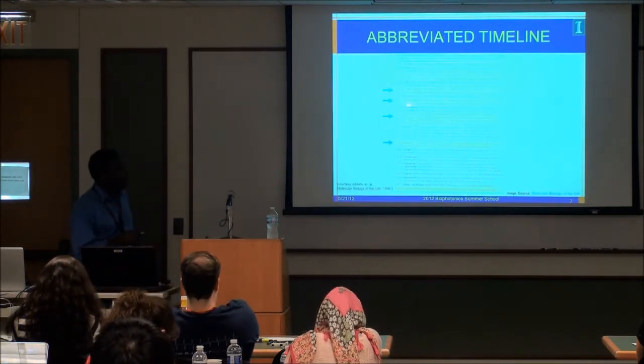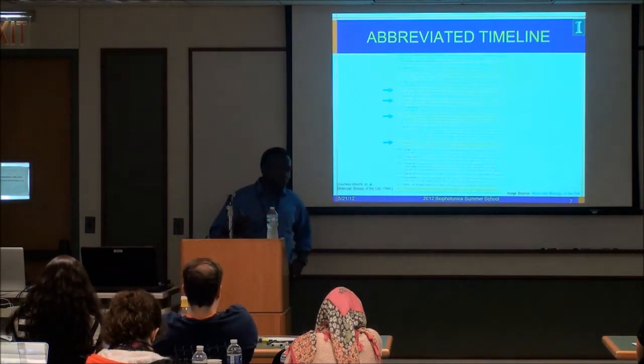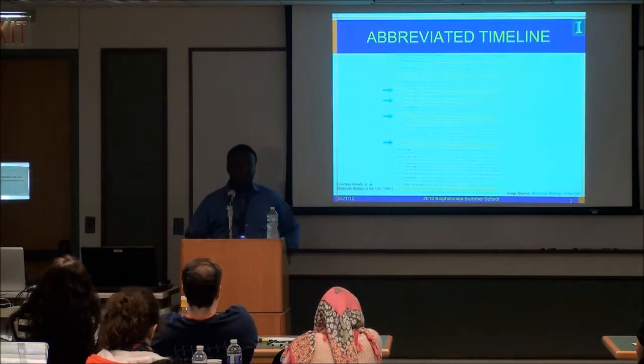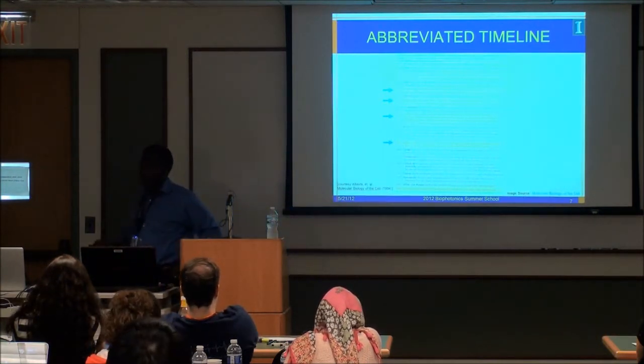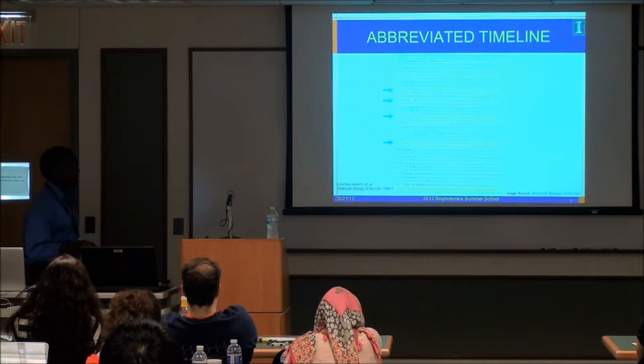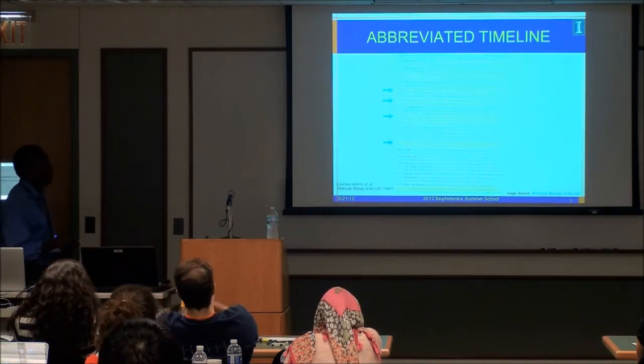Abbe, which was discussed earlier, in 1876. So Abbe was the first person who actually tried to apply diffraction theory to the resolving power of optics, really. So it's actually a very important contribution, what we kind of take for granted today, that he did.